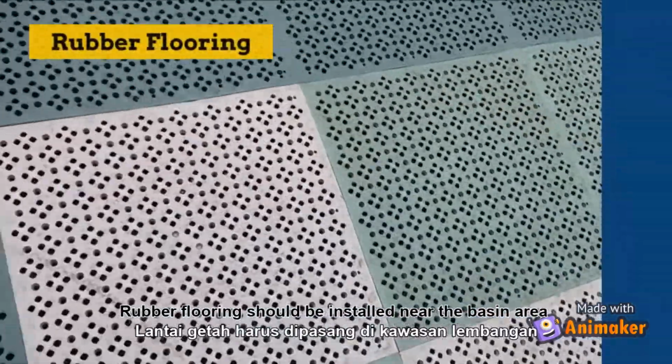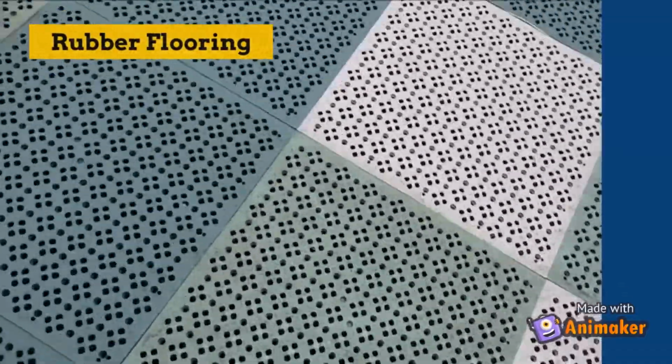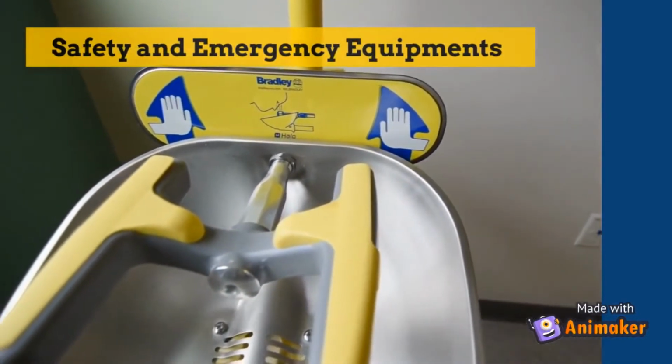Rubber flooring should be installed near the basin area to reduce the risk of falls and slips. Safety and emergency equipment should be set up in highly visible and easily accessible locations.